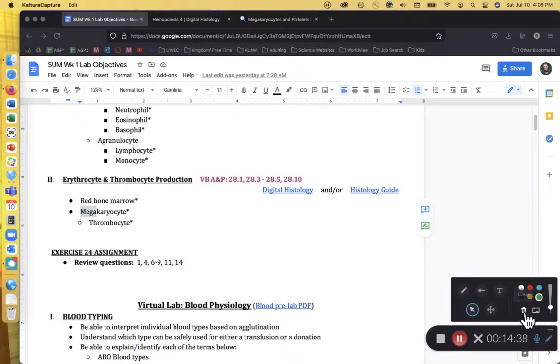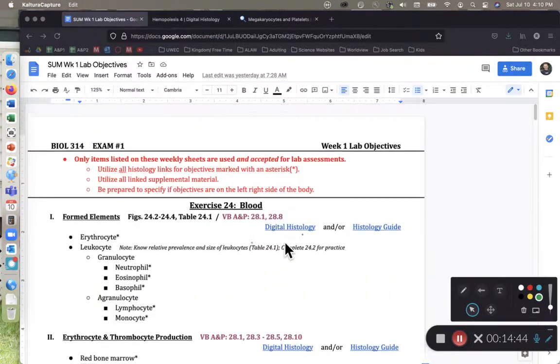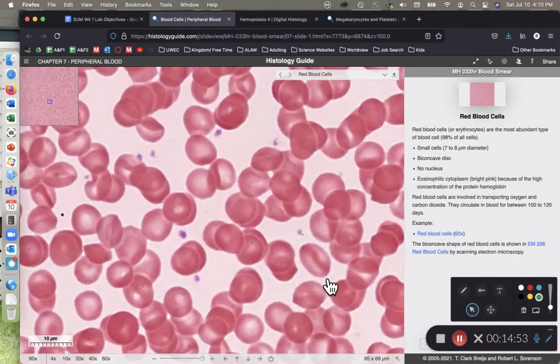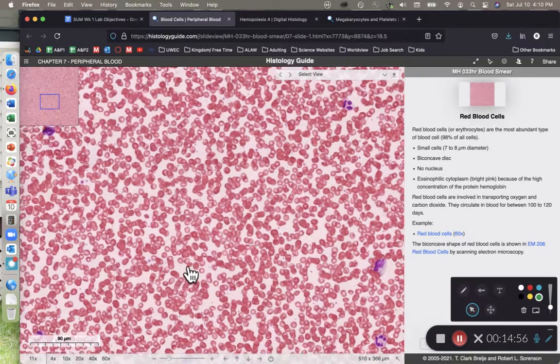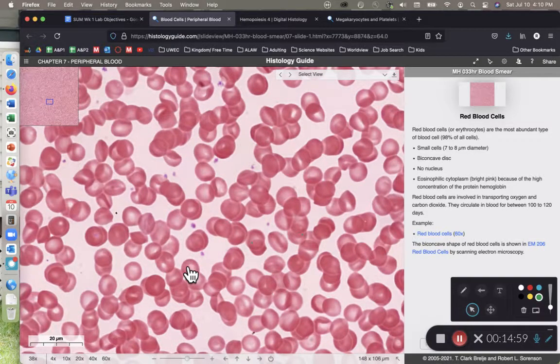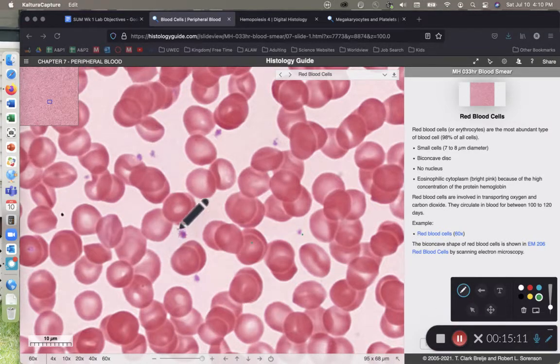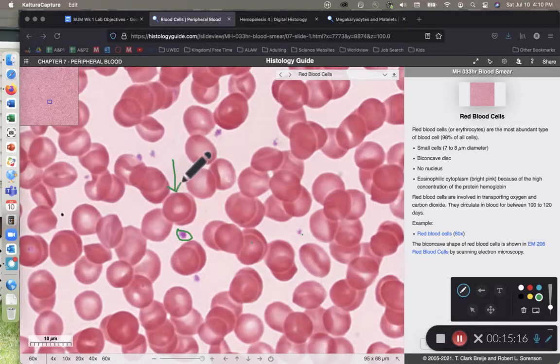So the megakaryocyte will slough off or fragment off thrombocytes into the bloodstream. To find some platelets, I'm going back to the histology guide site for blood. As we look at a classic blood smear, platelets are the only things smaller than the red blood cells. To use the technical language for your lab exam, thrombocytes are the only thing smaller than the erythrocyte. Here I can see a thrombocyte right next to an erythrocyte — I've circled the thrombocyte and drawn an arrow next to the erythrocyte.